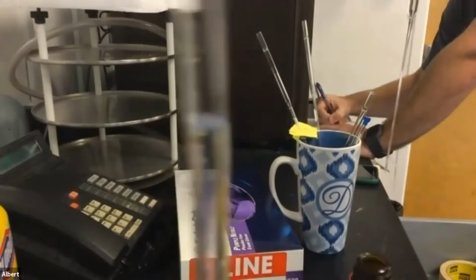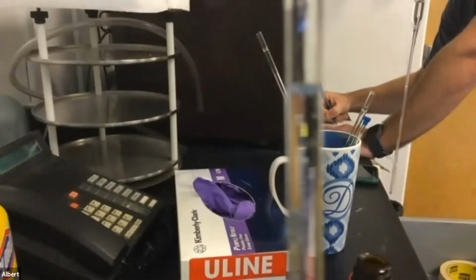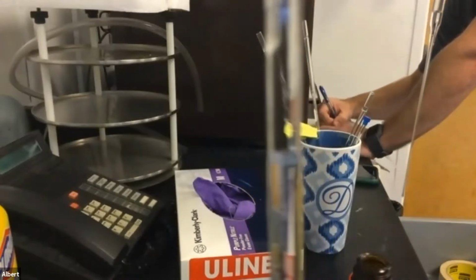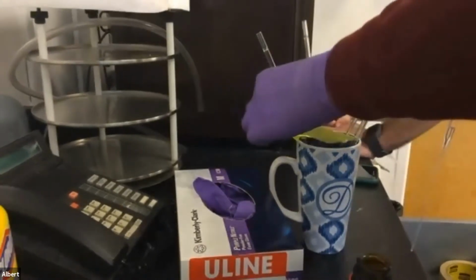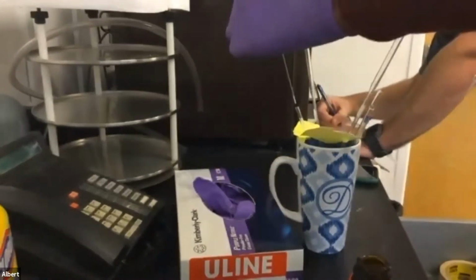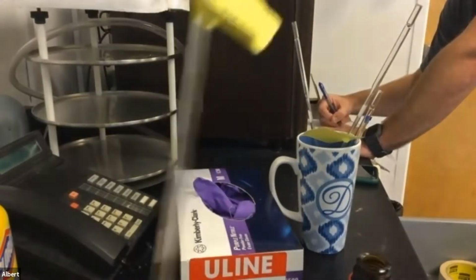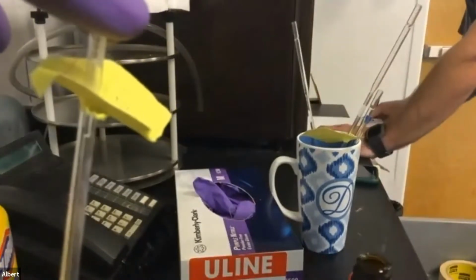So now you can see that sample is dissolved up. You can see the line. You normally want about 2 centimeters of chloroform in there, so that's fine. I'm going to dissolve up sample 2 the same way. All right, like so. I'm going to put that directly into that and just add the chloroform straight to it.